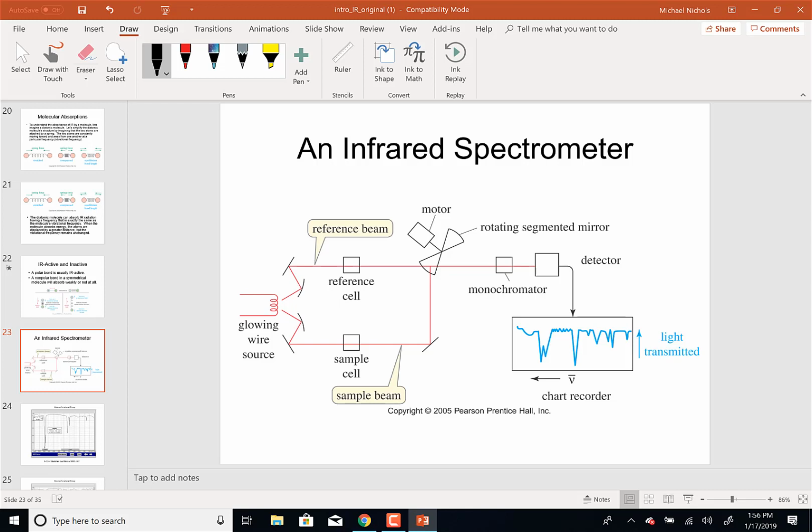We just basically need infrared radiation. Where do we get that from? We get that from a glowing wire, probably like what's in a light bulb. Although those are going away, right? Our incandescent light bulbs are being replaced by something not incandescent. So there'll probably be a day when there won't be any of those around.